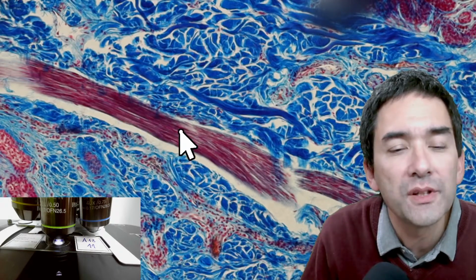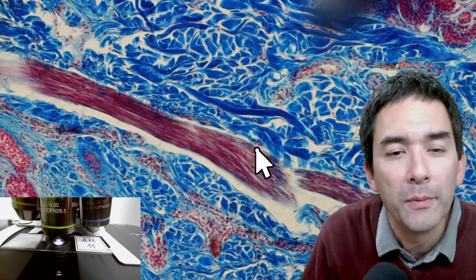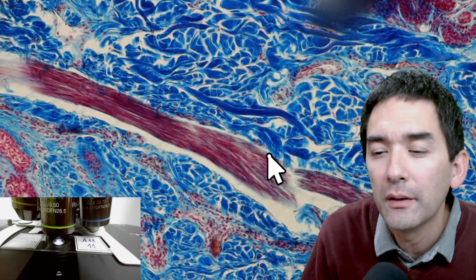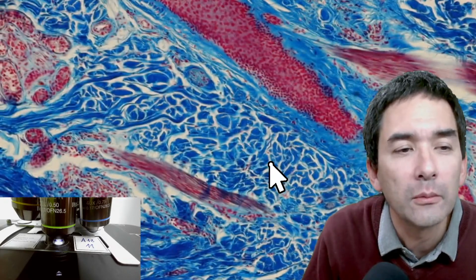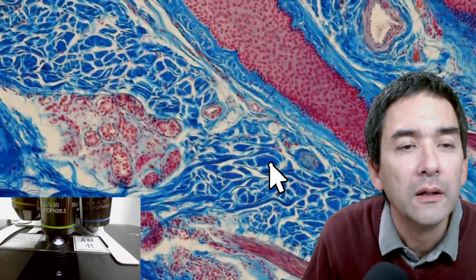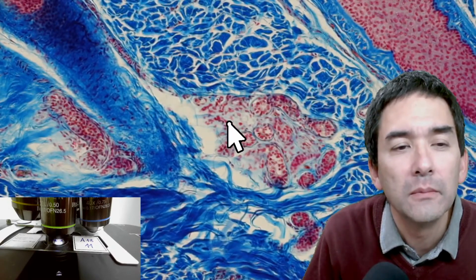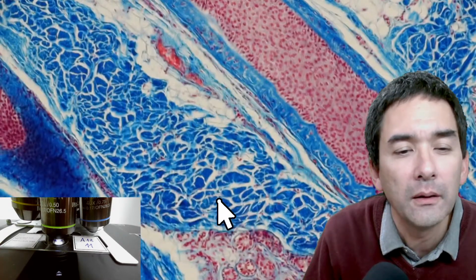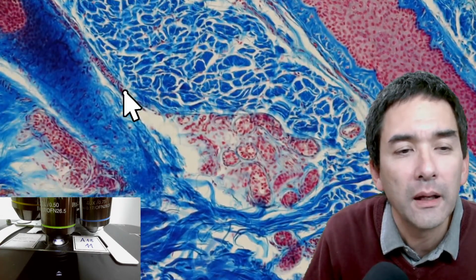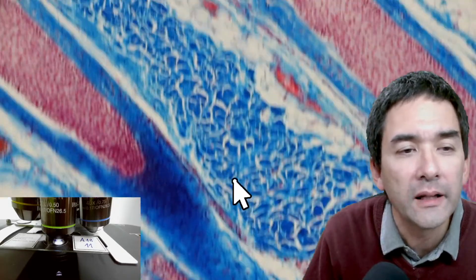As well, but that's kind of interesting because this also looks like muscles, but if they were both muscles, they should actually stain in the same way. So, not sure about that. But later I'm going to show you how it actually looks. Could be a gland, maybe, with a canal going into the hair follicle. Maybe an oil gland.